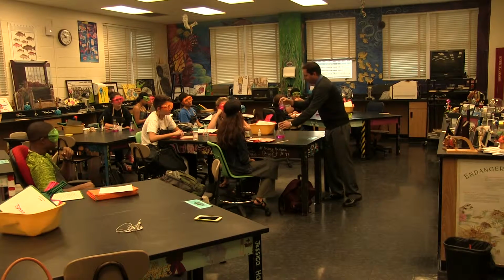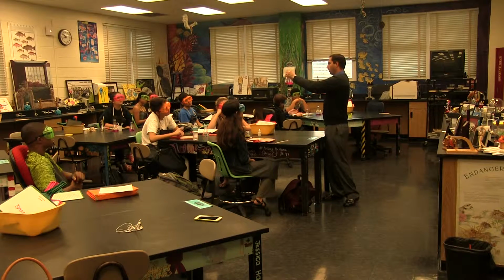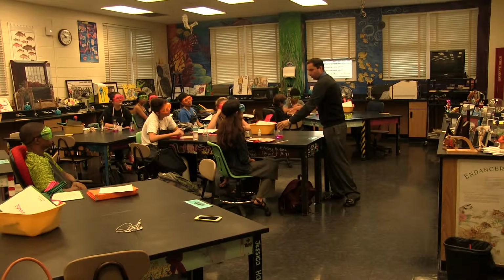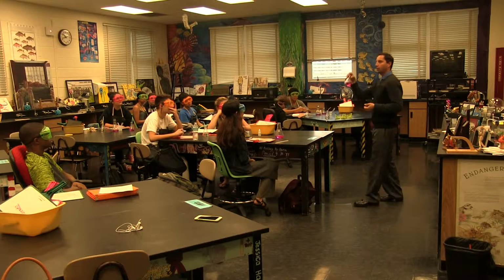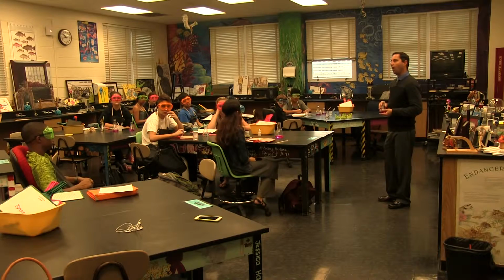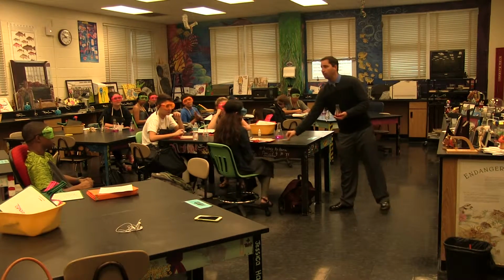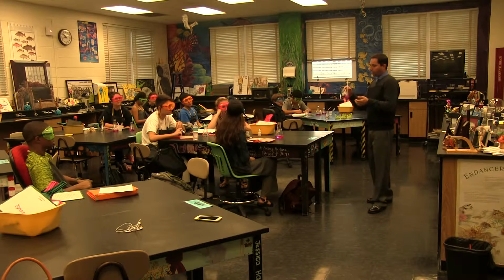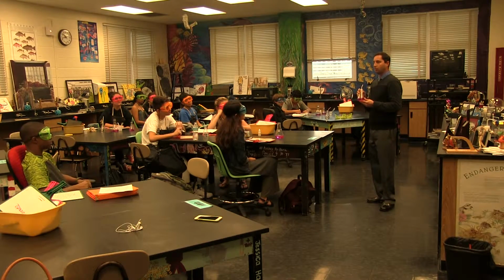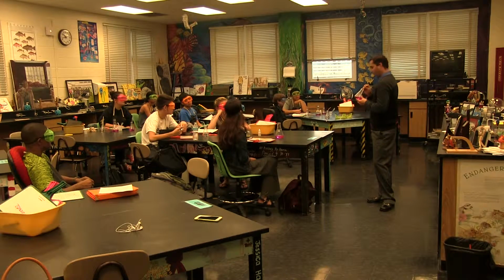It looks pretty good. And so we're going to use this colorimetric analysis to determine how much carbonic acid we can get in there. How are we going to get carbonic acid in here? All right, Bryce, you look excited. Why? Because of the carbon dioxide we breathe out. Fantastic. So if I blow into this, and I am getting carbon dioxide into it, it should no longer be basic because of that carbonic acid. It should be acidic. If it's acidic, what color is this going to turn? Julian? Unclear. Let's see.